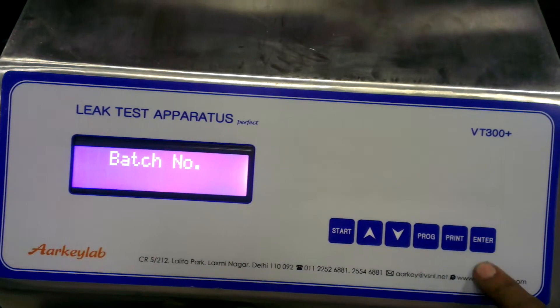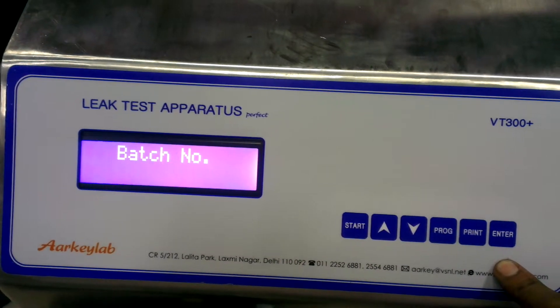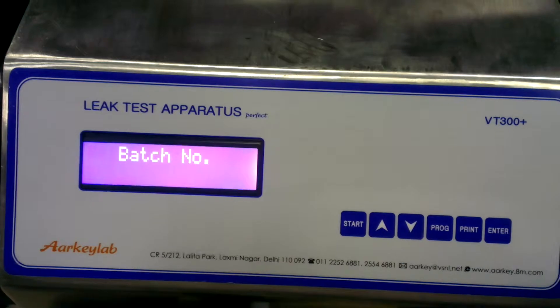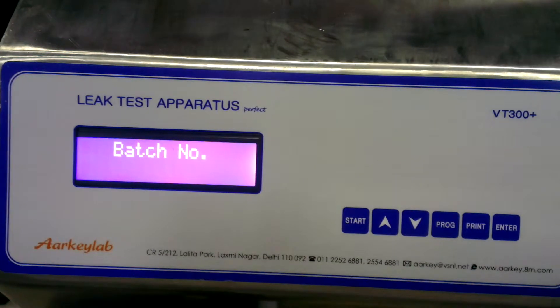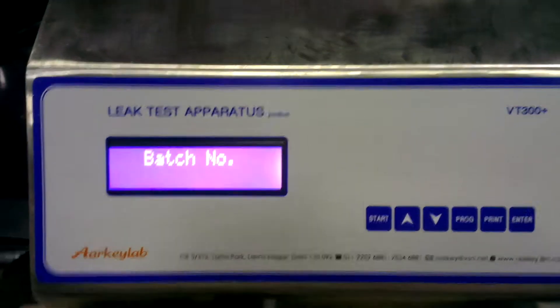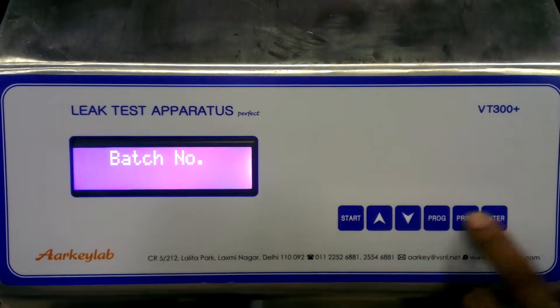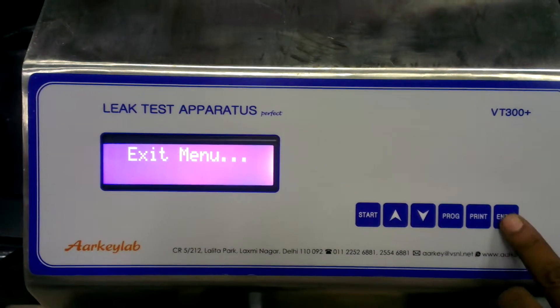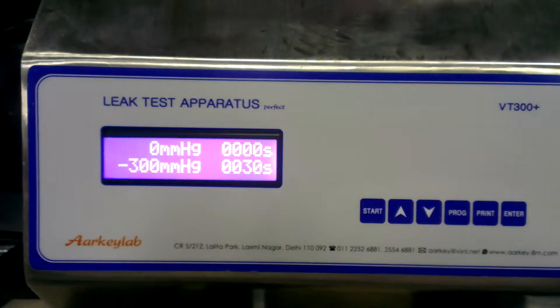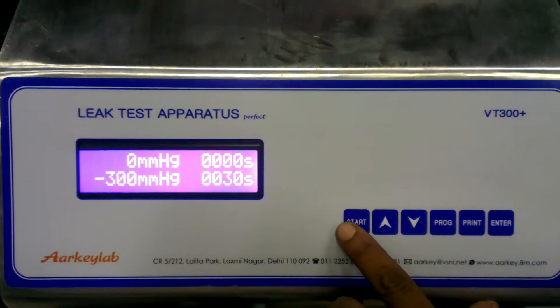Now with the Program key, set the batch number. Note that batch number is applicable only if a printer model is connected. Press the Up key to exit the menu, then press Enter. This is the home page — the system is now ready to start the test.